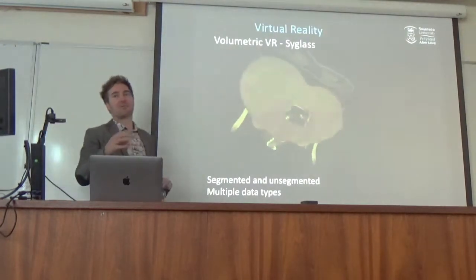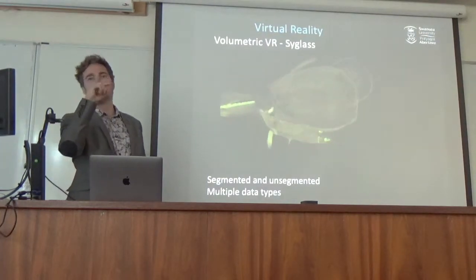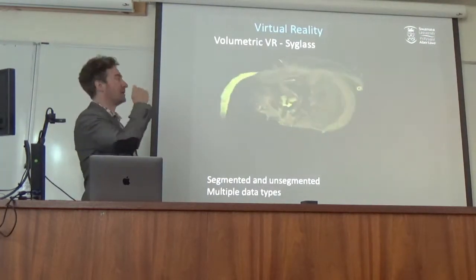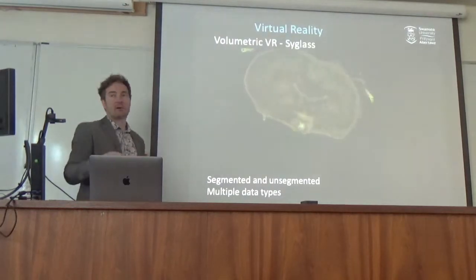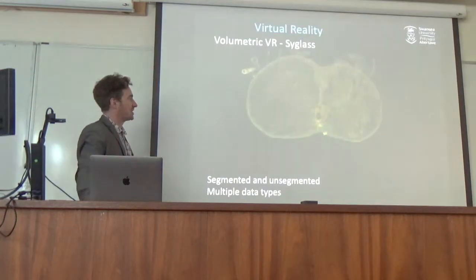It's incredibly easy to create these videos in the software because you're in it. You're like an actual camera person. You put your headset somewhere and you click, and that's where the next frame will be, and you move it, and it'll create an arc between them. So for me, this is going to help our communication, definitely. But also, I think the key difference is that it'll change our workflow.